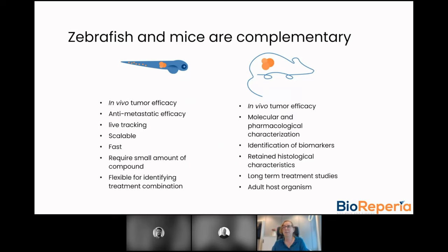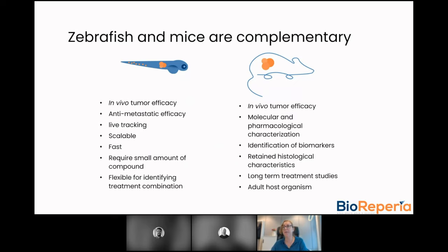In zebrafish you also get anti-metastatic efficacy data. Since embryos are transparent and the tumor cells are labeled with a red fluorescent dye, the tumor cells can be followed in the living embryo throughout the experimental time period. The zebrafish system also allows for higher scalability since assays can be done in 96-well format, enabling the model to be used for screening and providing a lot of data in a short time.